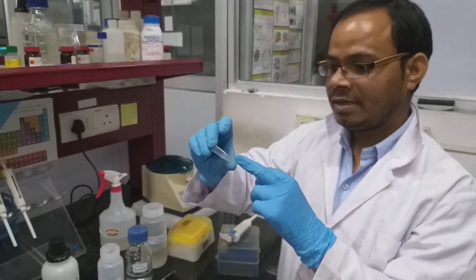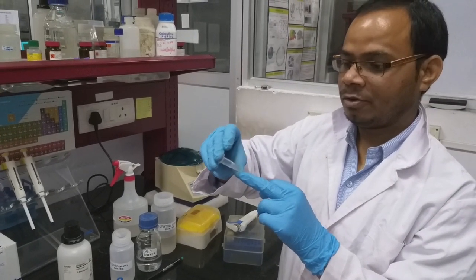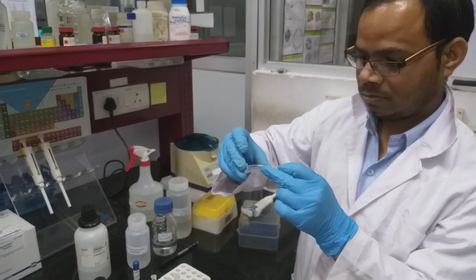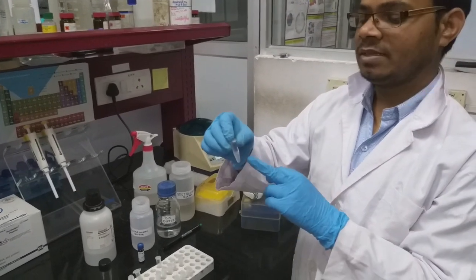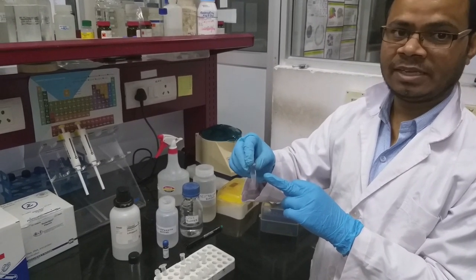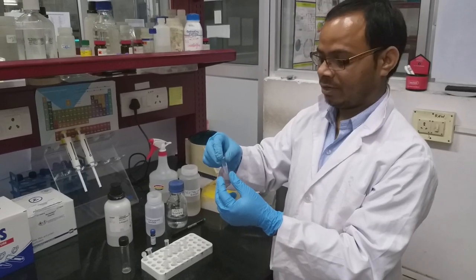Now we have to gently flip the tube in order to lyse the cells completely. We can keep it in this condition for up to 5 minutes, but not more than 5 minutes, which will degrade the plasmid DNA, and also genomic DNA will come out and it will interfere with the miniprep.